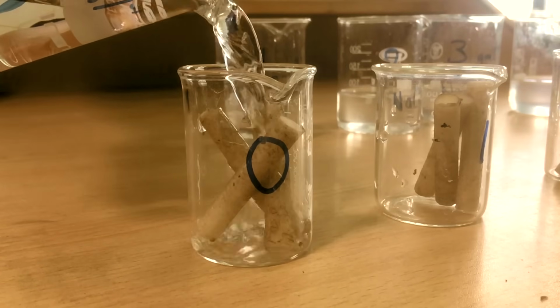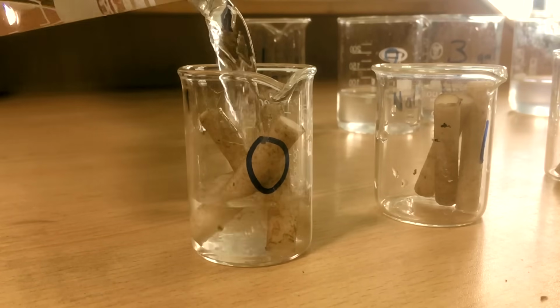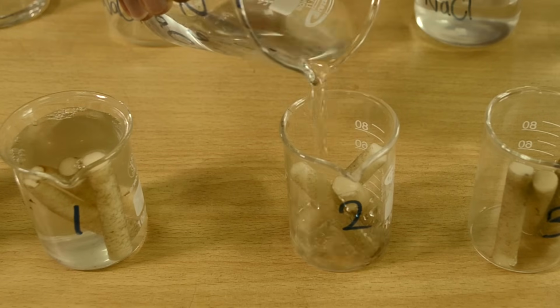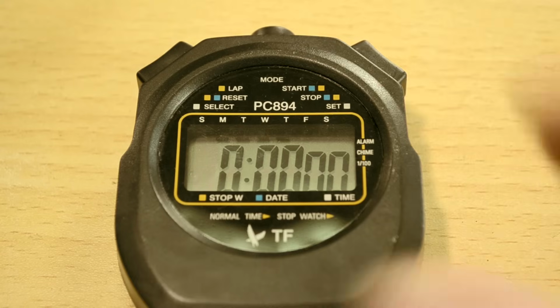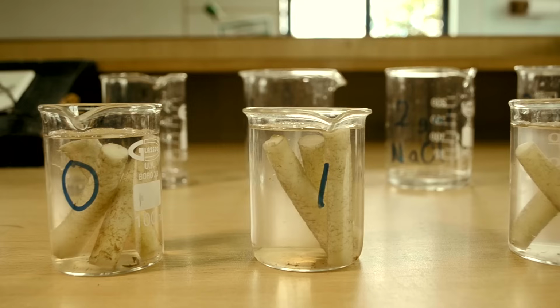Once the solutions are ready, pour them in to immerse the potato strips. Start the timer and leave them where they are for 20 minutes.